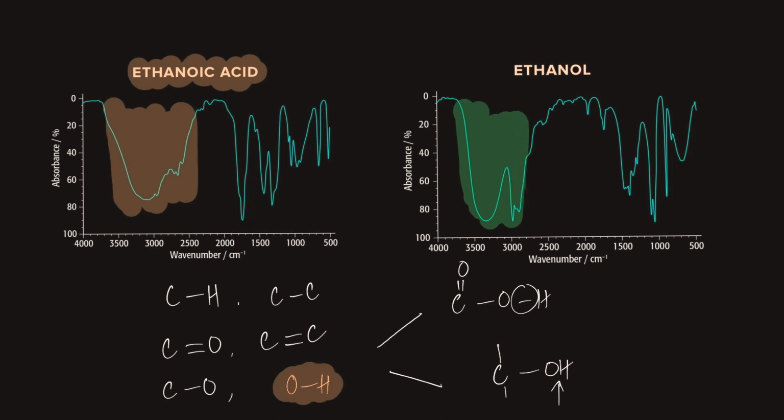They're both broad, they're both strong peaks. But if you look at them closely, they're very different from each other. The acid one almost comes in two loops. They look like two different peaks even though they're the same peak. For the alcohol, you see how smoother, rounder and more lobe-like it is compared to the one for the acid.